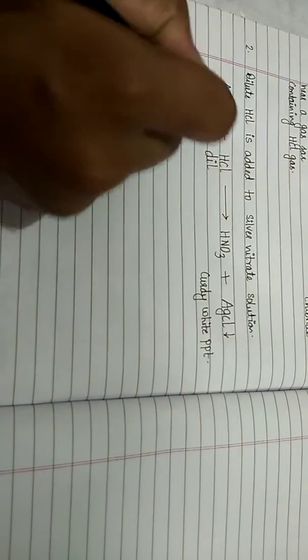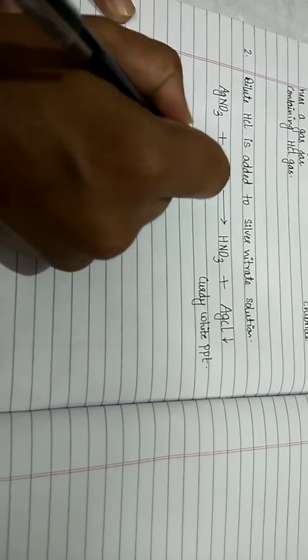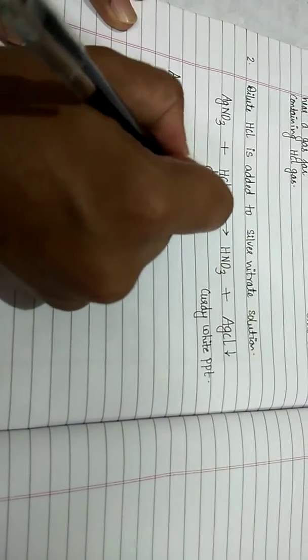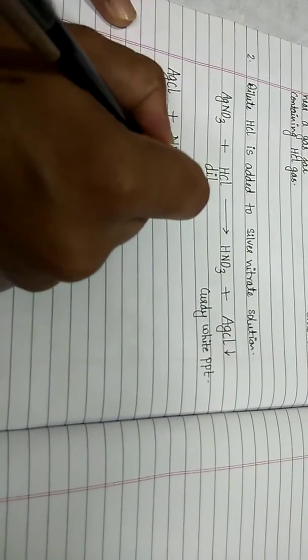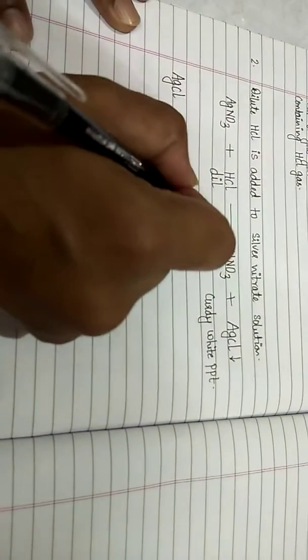to this, excess of ammonium hydroxide is added.